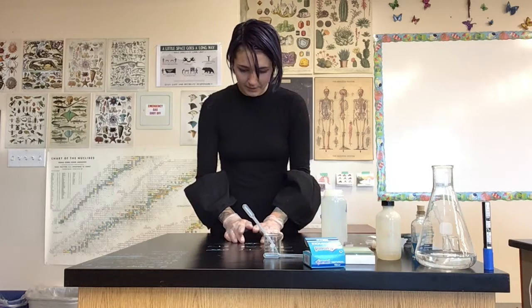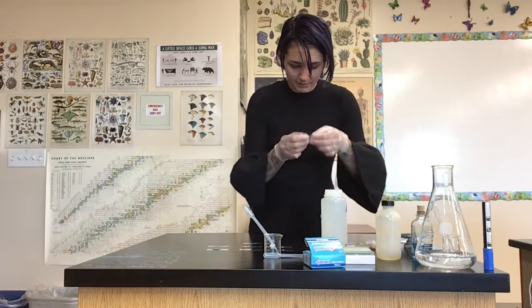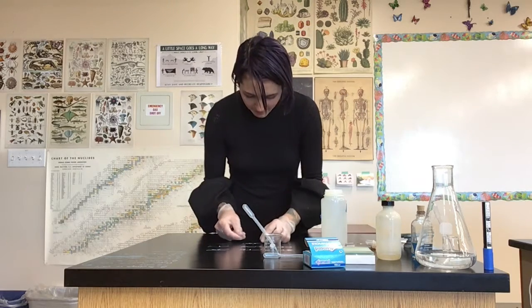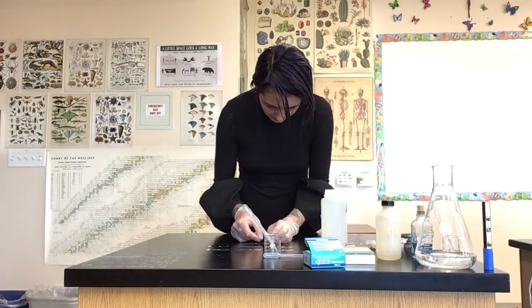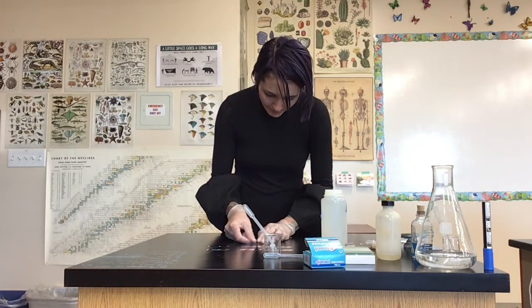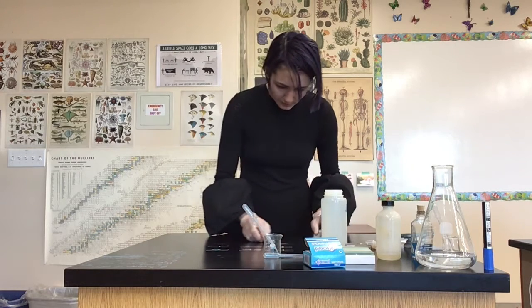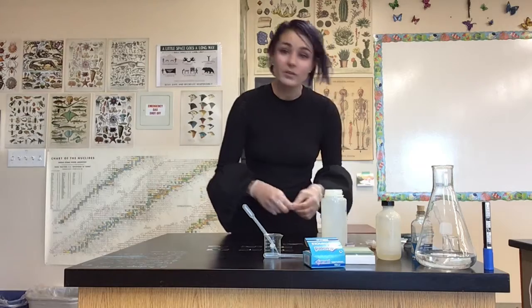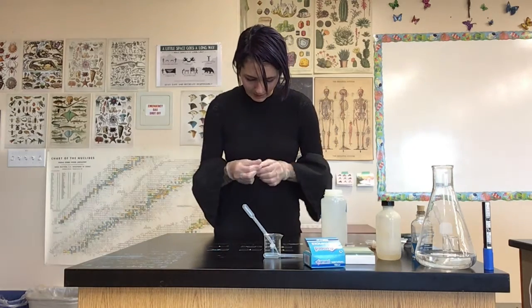The last thing that I'm going to do here is take my slide cover. I need a few of them since we've got a few slides here. And then the last part of this is to actually crush the roots enough to manually break apart those cell walls so that we can really get a glimpse at what's going on inside those cells.